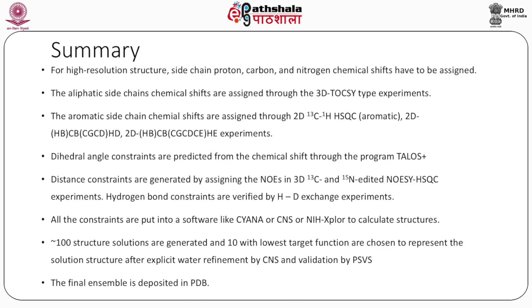Approximately 100 structure solutions are generated and 10 with the lowest target function are chosen to represent the solution structure after explicit water refinement by CNS and validation by PSVS. The final ensemble is deposited in PDB and analyzed for various purposes. Thank you.